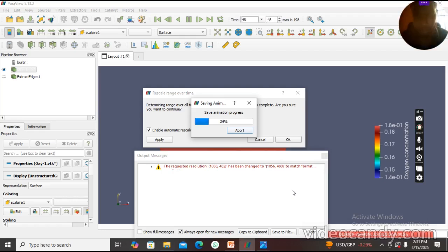So ParaView is a good tool that is used for analyzing scientific data, and here we have used it to analyze cell viability, so that we can see where these cells can be put for them to survive and for how long they can survive.